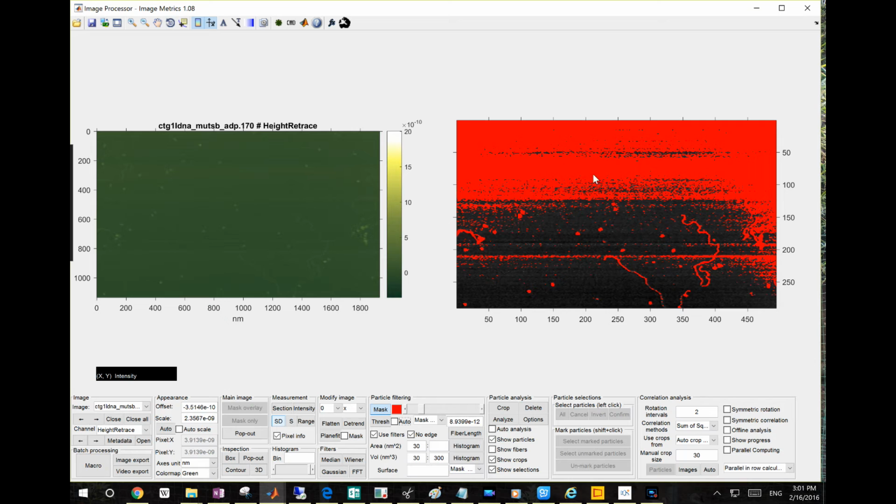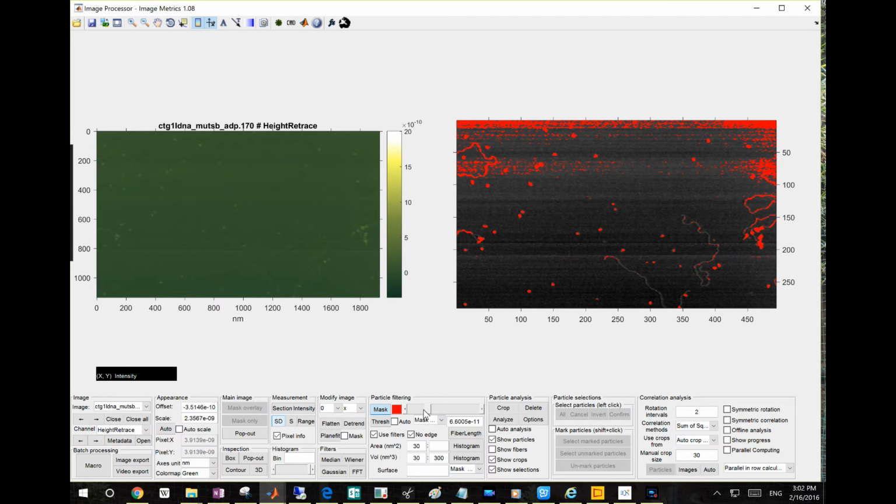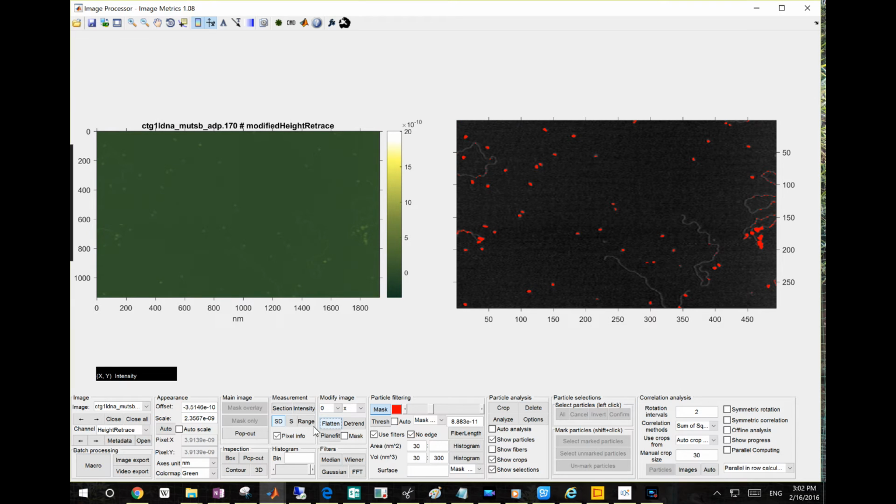So right now the image is still not flat. As you see from the threshold, the top area is higher than the lower area. So apparently we need some more flattening procedures. What I would do is a 0 order auto flattening first. I don't think it's 0 flattening right now, so yes, let's do a 0 auto flattening. The 0 auto is always the first step, but we want to do more.